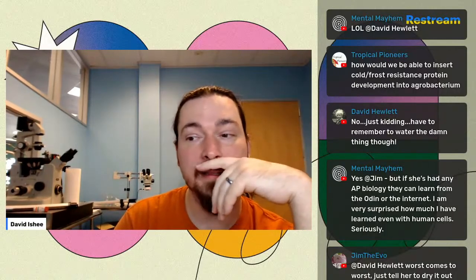What was I saying? DNA synthesis. Yeah, so the easiest way is to just send it off, have it done. You can edit DNA yourself by subcloning. That's a whole complicated thing, though. It's really not that bad. You've got to use special enzymes and stuff like that. My YouTube channel has, or at least used to have, a few videos on subcloning. They may be on my Odyssey channel now because YouTube removed a lot of my educational videos.